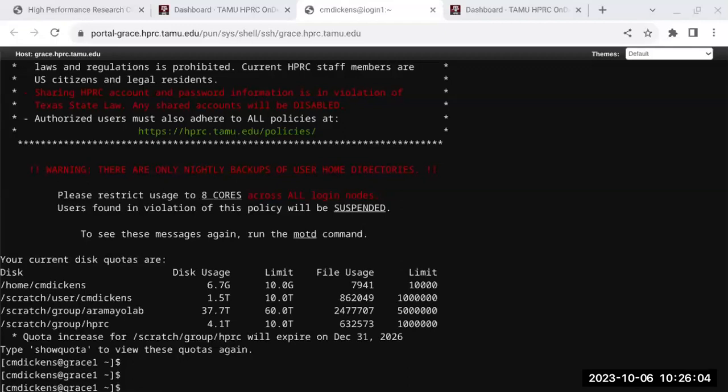So then this longer strand here in the middle with the different colors, you can see that it sequenced the template, then it sequenced the top strand, it sequenced the template again as it went around the loop, bottom strand, top strand, bottom strand. So you can get all of these what are called subreads and create a consensus sequence. This consensus sequence is more accurate than if you were to just take one of these reads, because the error rate is a little higher for this type of sequencing.